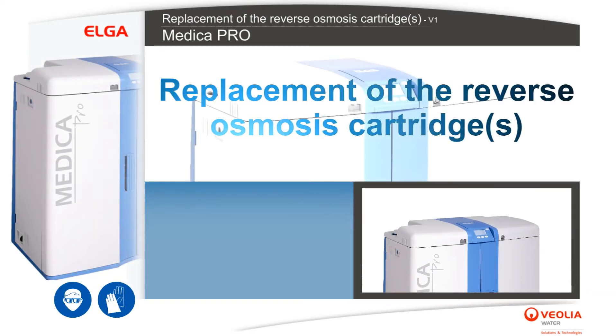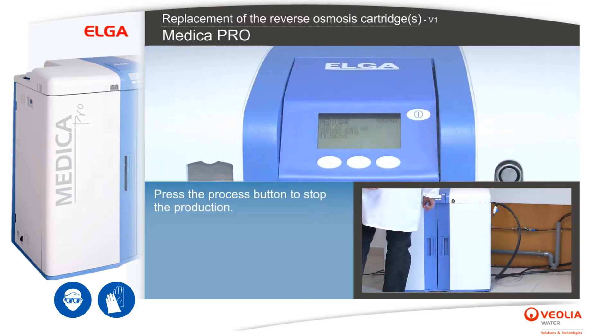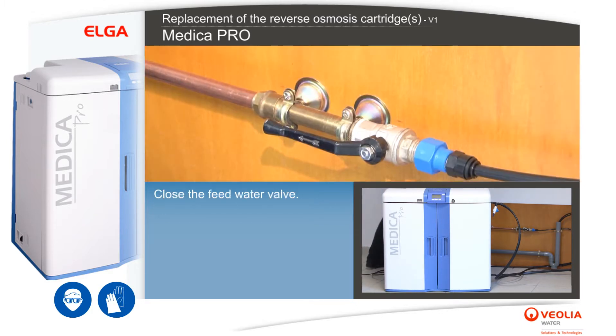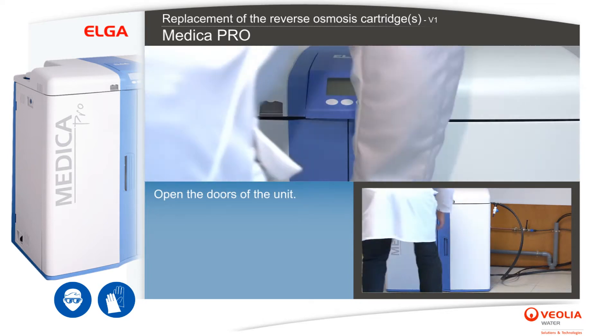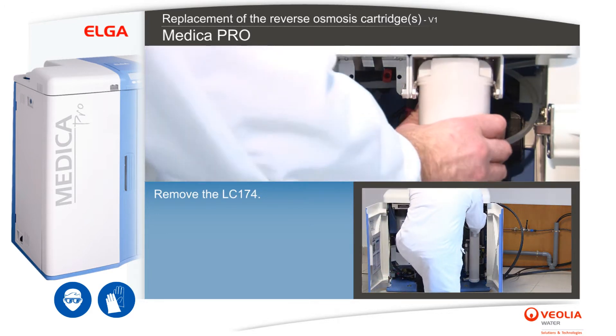For replacement of the reverse osmosis cartridge or cartridges, press the process button to stop the production. Switch off the unit by pressing the on/off power switch. Close the feed water valve. Unplug the unit from the mains electrical supply. Open the doors of the unit and remove the LC174.